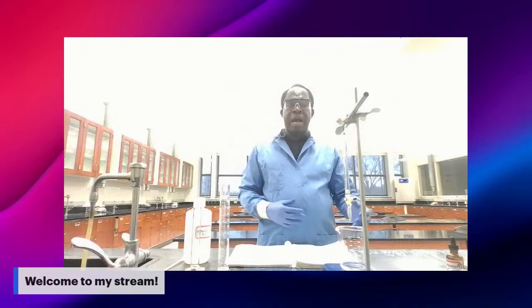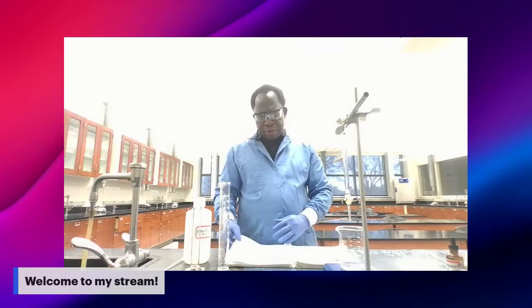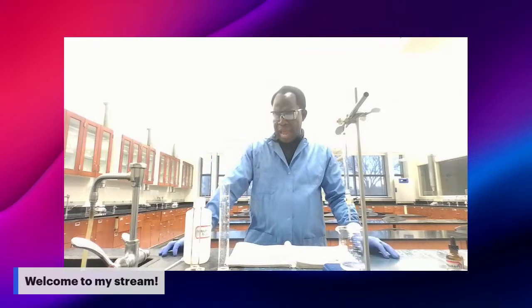Those are what you need for the calculation part of this lab.